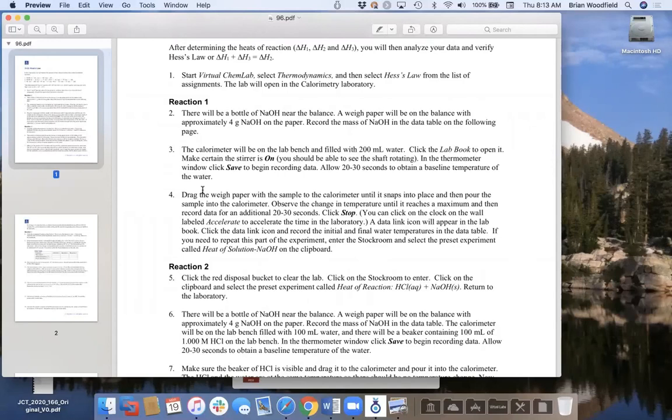These are pretty highly structured in the sense that we're giving them instructions, but we follow a pedagogical framework called POGIL, if some of you are familiar with it, Process-Oriented Guided Inquiry Laboratory. So it's about discovering through doing the labs, and it's about following Bloom's taxonomy upward.